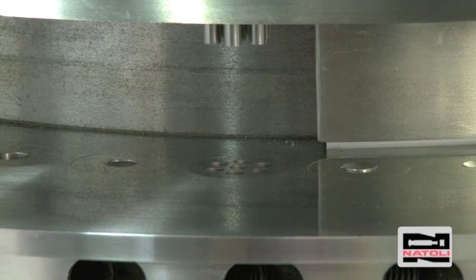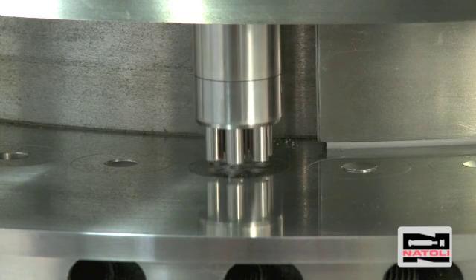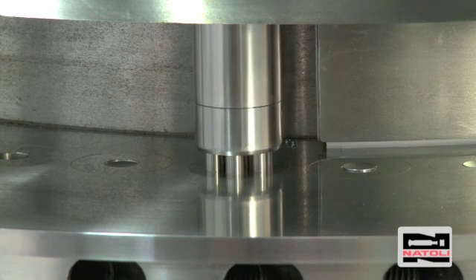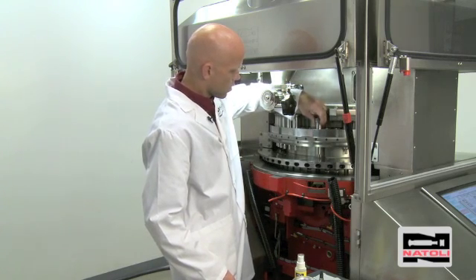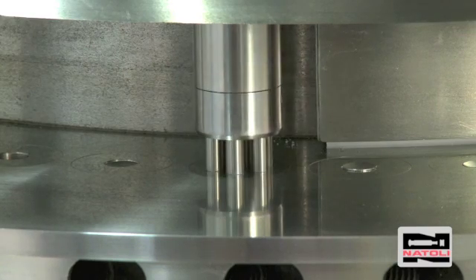If you hear a clicking sound, that means there is misalignment between the punch and die. The goal is to have the punch tip enter the die bore smoothly. A minimal amount of contact is acceptable. If there is misalignment, remove the die and reseat.